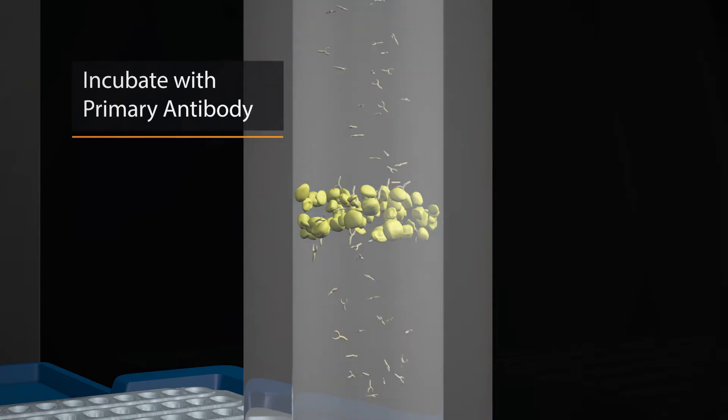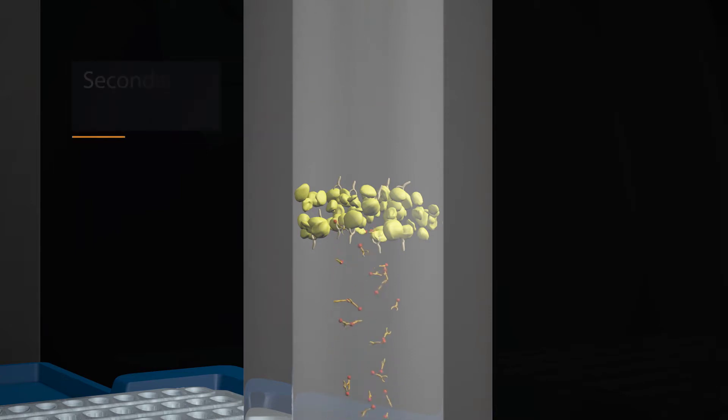Wes first incubates with your primary antibody of choice, followed by a secondary HRP conjugate, and finally, chemiluminescent substrate.